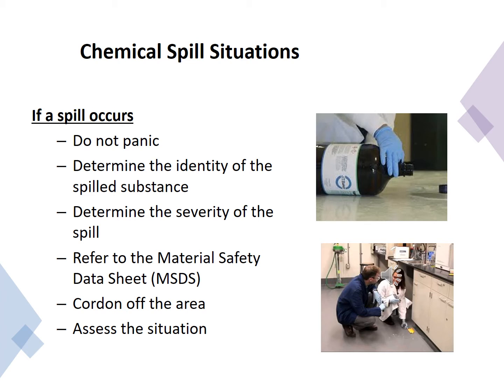As I mentioned in the earlier slide, chemical spillage is a routine matter, because if you are working, there are of course chances. But the point is whether it is a minor or a major spillage. Your response should be: do not panic. If you are in your senses, then you can handle the situation very well.